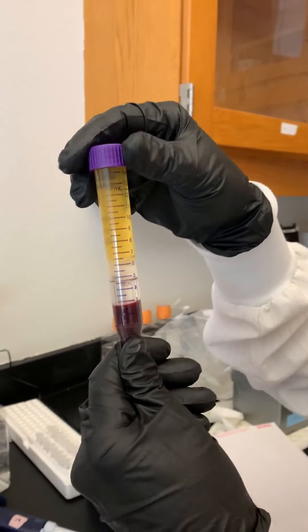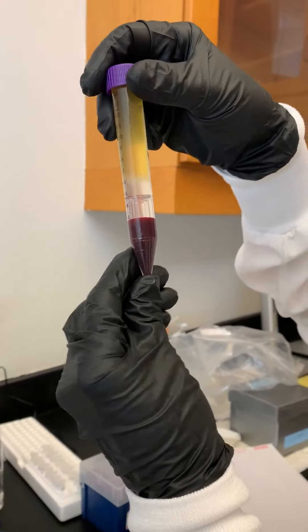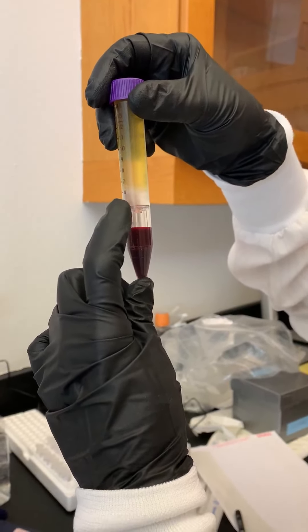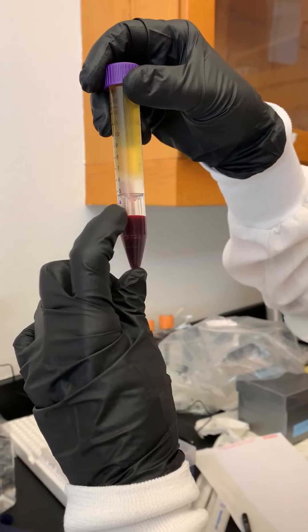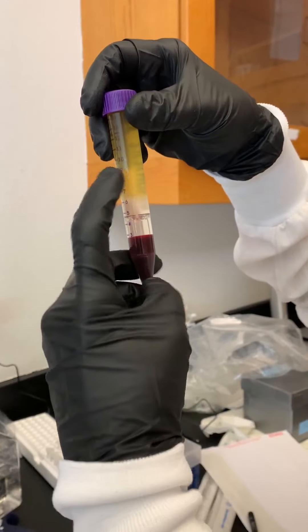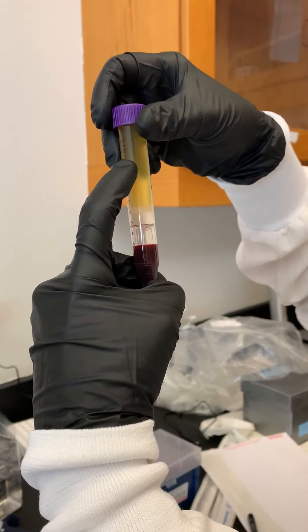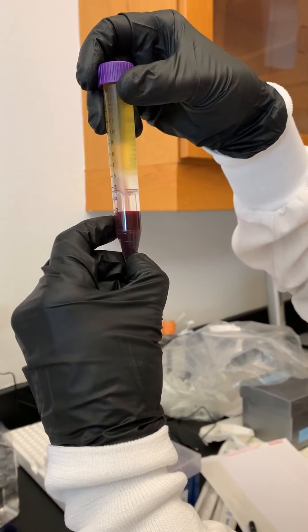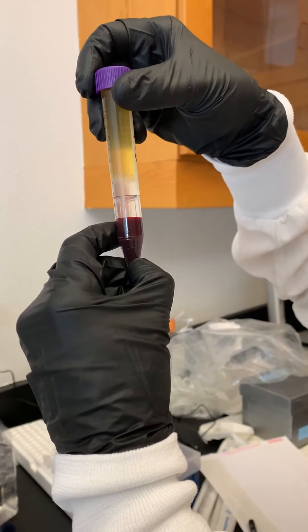We just spun the blood sample and I'll show you the different layers. The insert, which was pre-filled with the density gradient, actually separates the different parts of the blood that we want. The red blood cells go to the bottom, the plasma and serum are up top, and this clear layer in between is where our cells of interest lie.